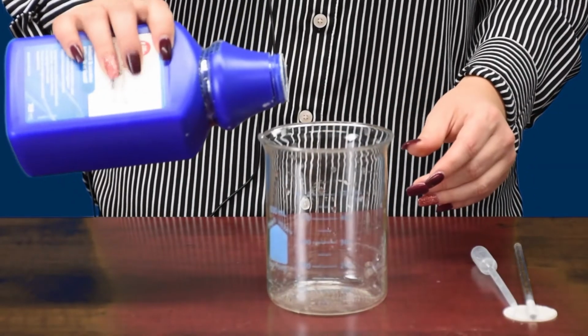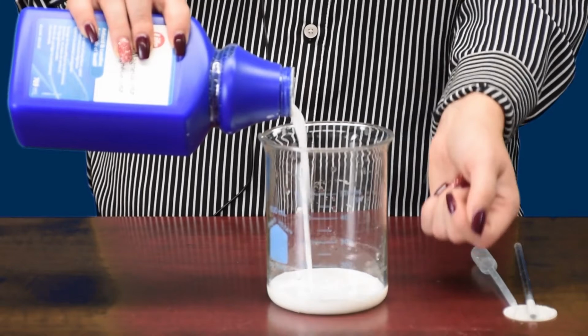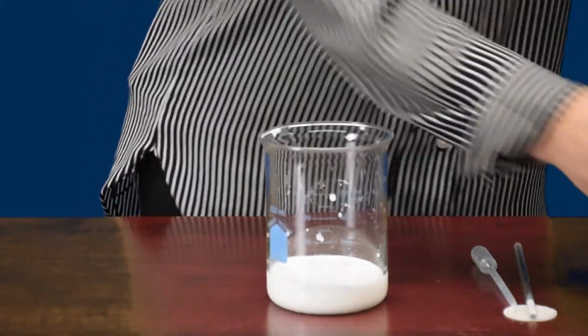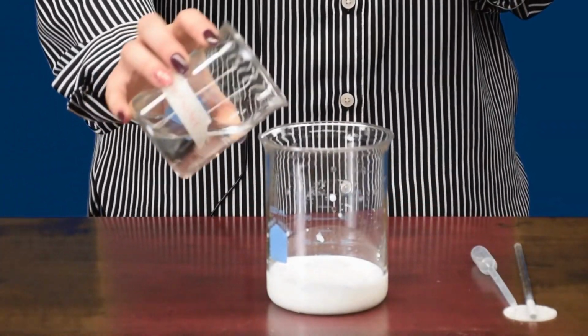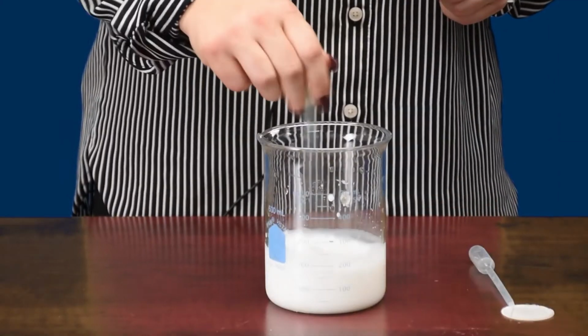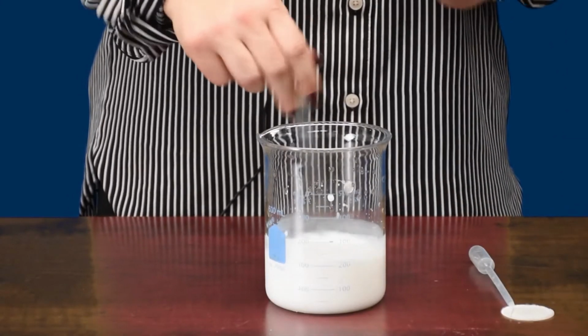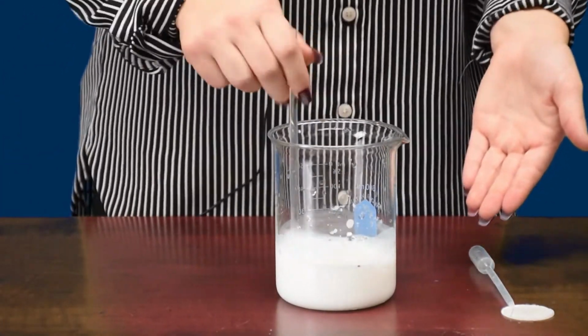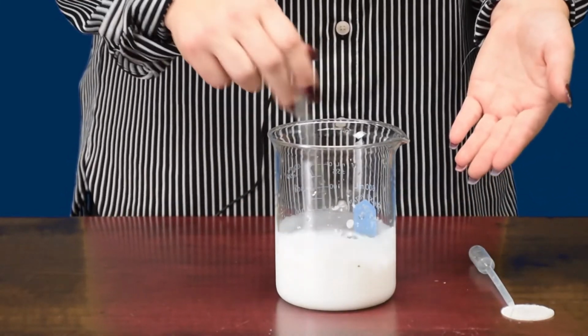Another common question that students have about this is, what if we went through this experiment without adding any universal indicator? So now we're going to do this experiment again, but we are not going to use the universal indicator. So once again, we will use our milk of magnesia, filling it up to the 100 milliliter mark. And once again, we are going to take our distilled water and fill this up till about 250. So we're going to stir it up. And what do you notice about the color? It's still white. Okay, there is no purple, there's no colors at all.